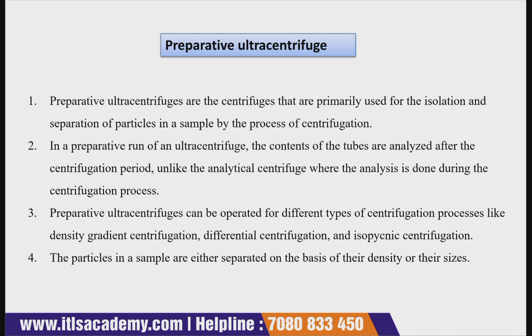So preparative centrifuges are basically used for the isolation and separation of particles by the process of centrifugation. This type of ultracentrifugation also depends on the sedimentation principle, and they separate the particles on the basis of their density or sometimes on the basis of their sizes.